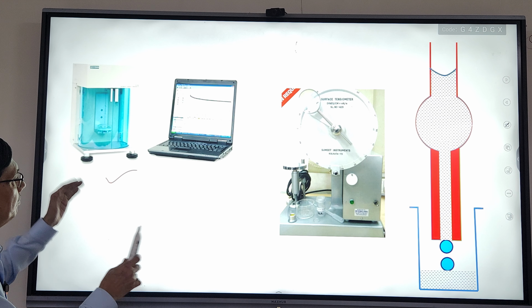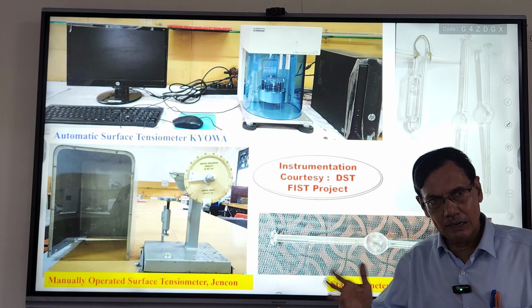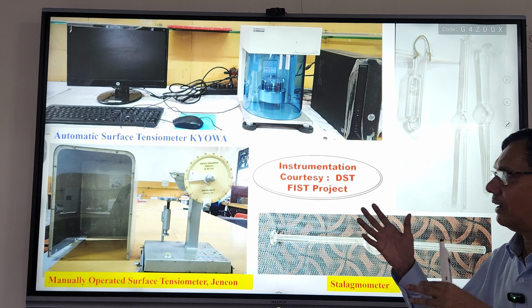And you know, there is a very simple stalagmometer method where we can take some surfactant solution and just count the drops, particularly through a capillary. And if you see my lab, today we'll use this. You are all MSc first semester students, and every year they perform this experiment, nothing new. But for clarity and novelty, before doing the experiment, it is necessary to learn the technique, some theory and the background.